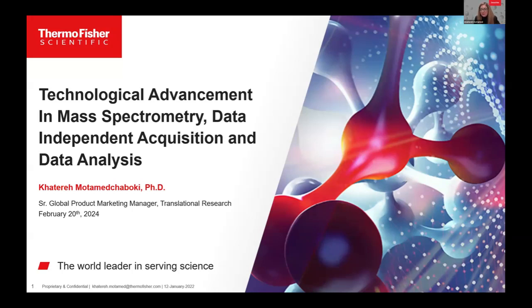Then I moved because of my family to the Bay Area and moved from an academic research center into what they call product marketing. I was involved in launching Eclipse, Orbitrap Exploris 240, 480, FAIMS Pro, and single cell proteomics DIA methods, and MaxID methods. I then went to SEER, did plasma proteomics and translational research for 3 years, and now I'm back at Thermo doing global product marketing and translational research, focusing on large cohorts and how our technology and workflows support bigger studies.